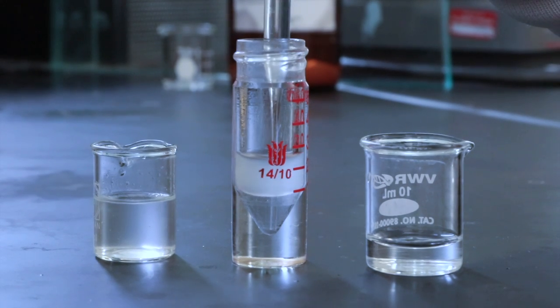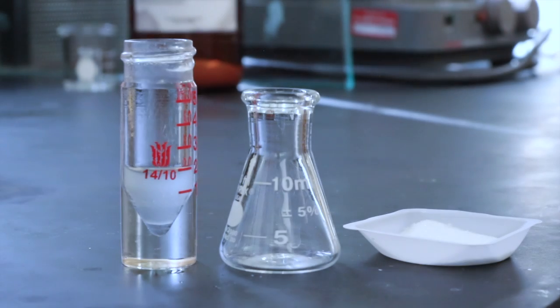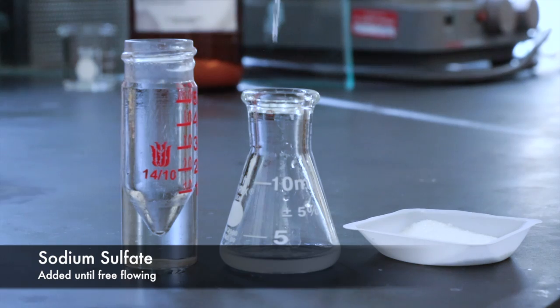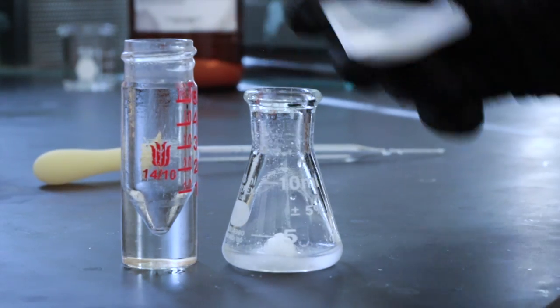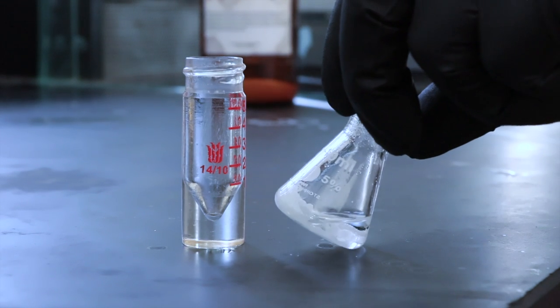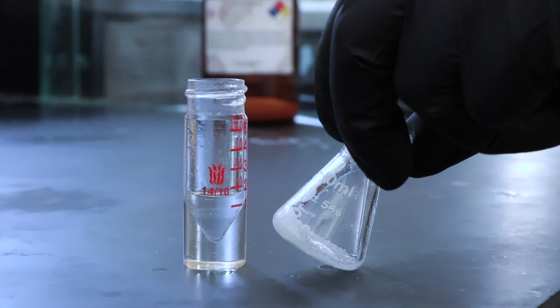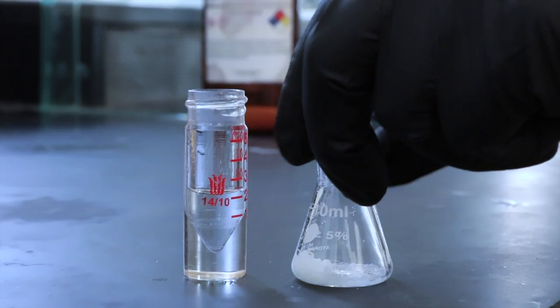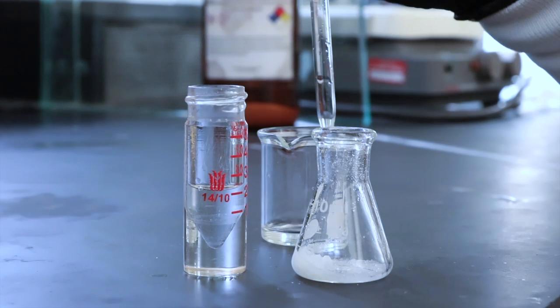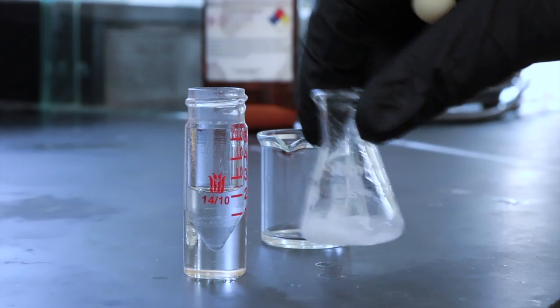I can remove the remaining water now, and then I'll go ahead and move the organic layer to an Erlenmeyer flask where we can dry it with sodium sulfate, and I'll add that until it's free flowing. I'll go ahead and remove the ether now, and after doing so, I'll actually add a little bit more to the sodium sulfate just to reclaim any product, any 1-octanol that might have been left behind.